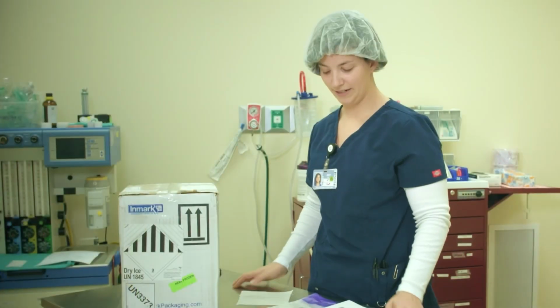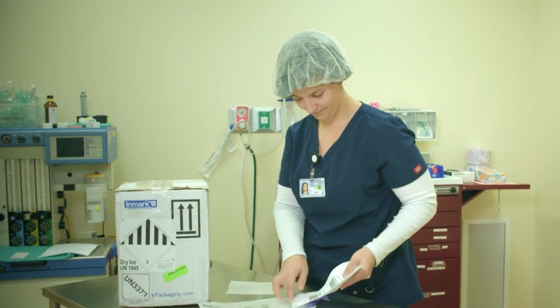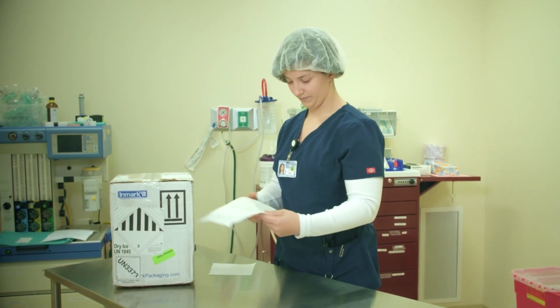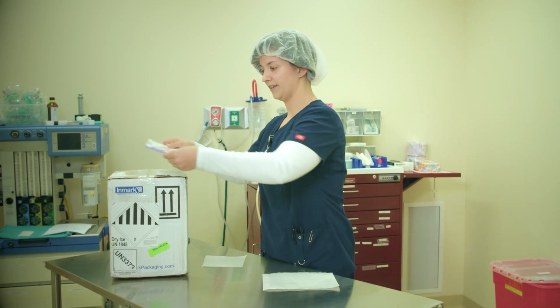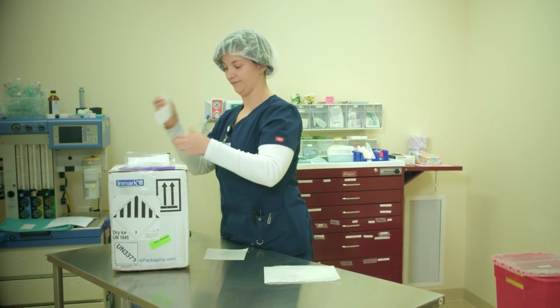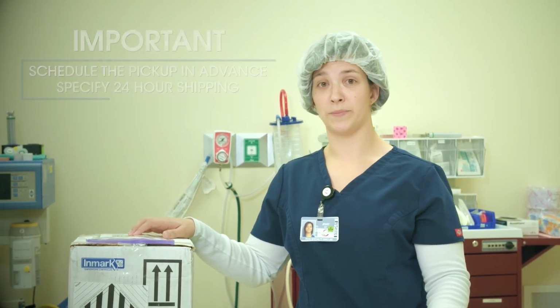With your box properly labeled, take a shipping envelope and put your shipping label inside. Close the flap and peel off the large adhesive on the back. Place it on top of the box. And take off that last piece of adhesive. Now you're ready to ship. To ensure that the samples arrive within 24 hours, I've already scheduled my pickup.